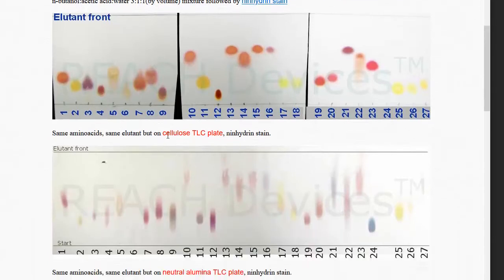Another option is a cellulose TLC plate, which is what we're actually going to do in lab. This gives a little bit better separation between all the compounds. One or two clear disadvantages is that you can't see some of them very clearly. So imagine you're running an amino acid ladder where you've got 6 different amino acids. If it was amino acid 2, 3, and 4, you'd have a very hard time differentiating those 3 as different when you run your ladder to compare it to the individual compounds. Now 2 has an advantage where it's a different color, so if these 3 were on here, you could probably at least say you had 2 and then either 3 or 4.